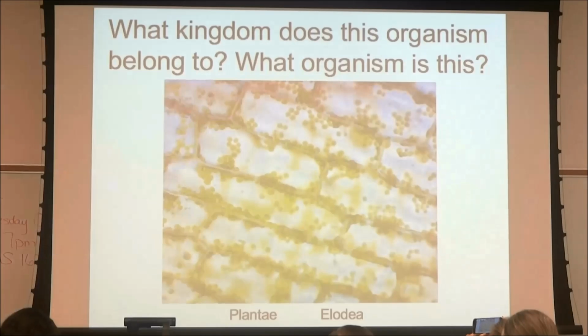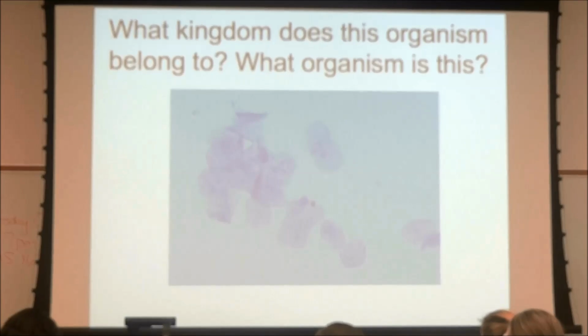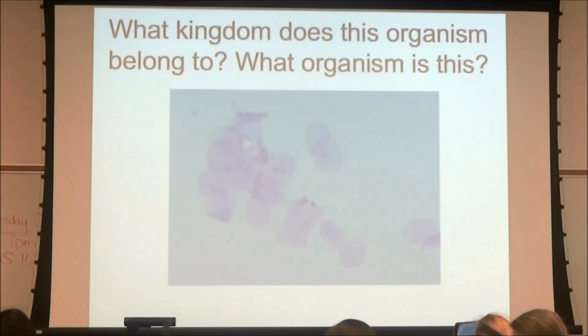Okay, I can switch. Yes. All right, what is this? The cheek cells. It's the cheek cell. Good. So what organism or kingdom does it belong to? Animal. Animals. And how did you know it was the cheek cell?